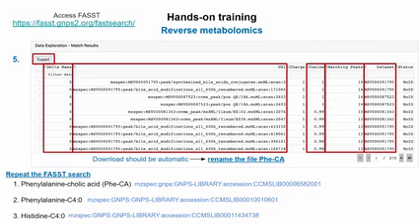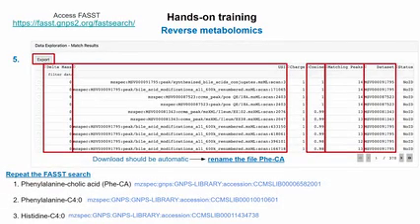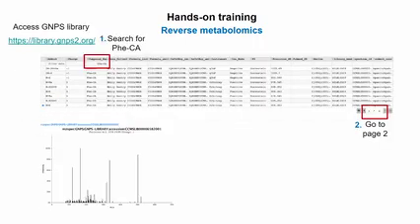Yeah, it was a great question, actually. We just repeat it because I think it's valuable to keep in mind. The question was how you select in the library which spectrum you should take, because sometimes you have, for the same molecule and same adduct, more than 1 spectrum, pretty often actually. And what's the right one? That depends very often on the context, right? Some of the spectra are generated by TOF, some by Orbitrap, with different collision energies and different noise levels. It's all very different.